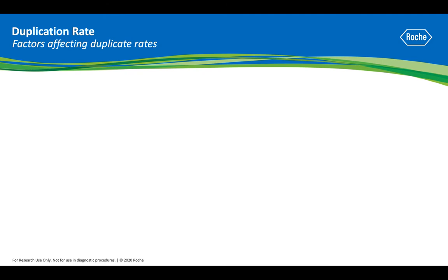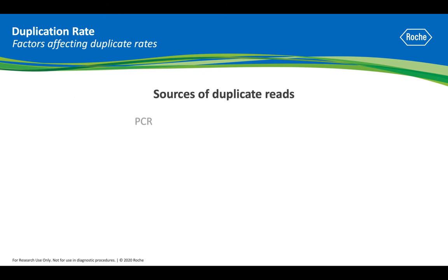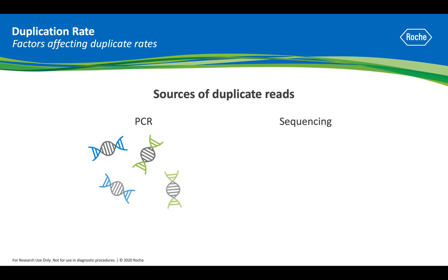Duplicate reads can arise from different sources. PCR is a common source of duplicate reads, known as PCR duplicates, where a single library is preferentially amplified resulting in excess of the same library, thereby lowering the overall complexity of that sample library.